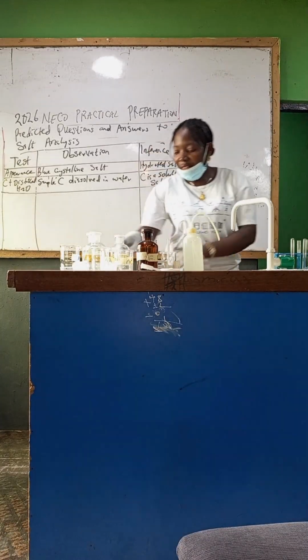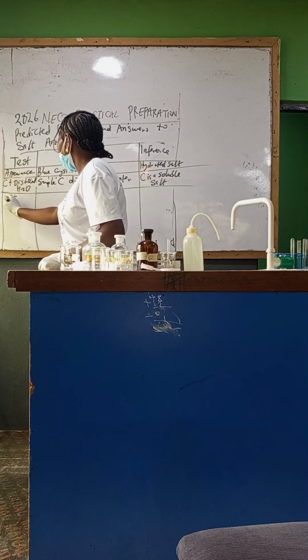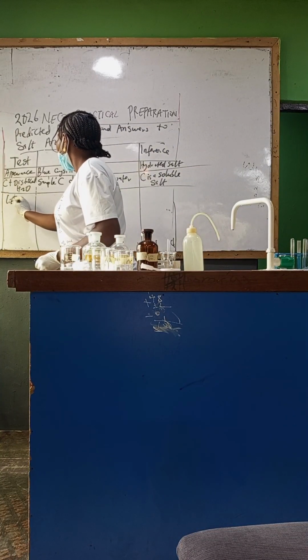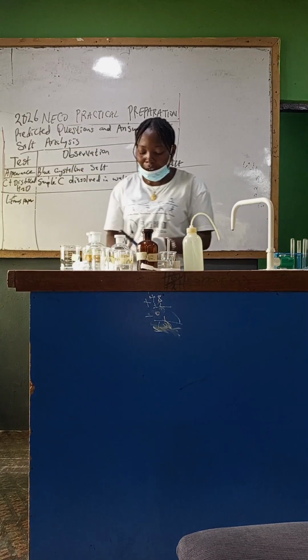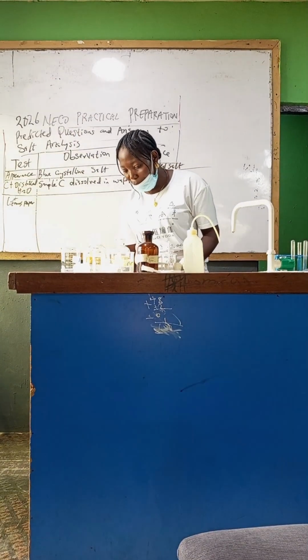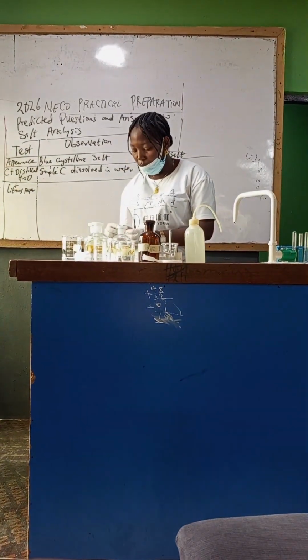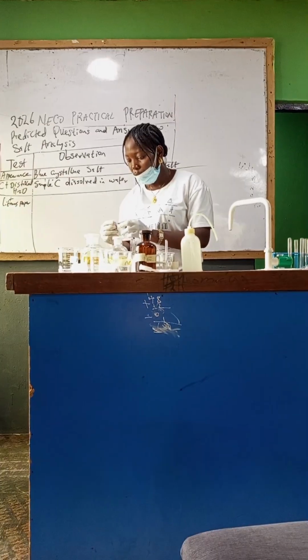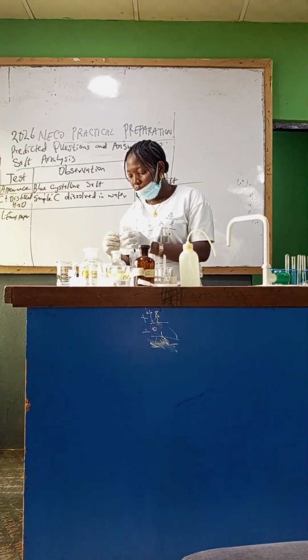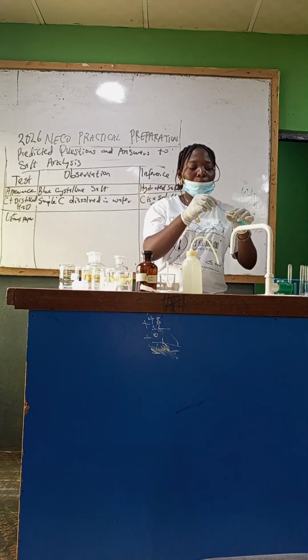Then the question now says plus litmus paper. Here is my litmus paper.